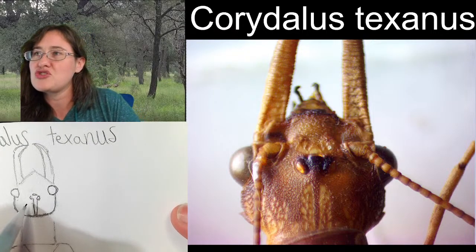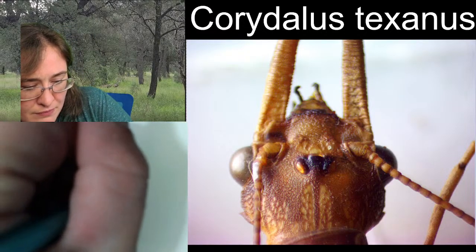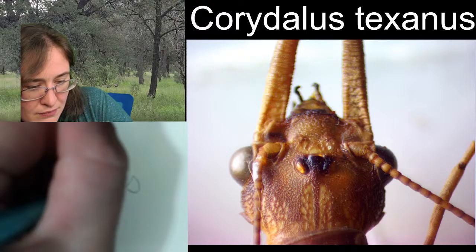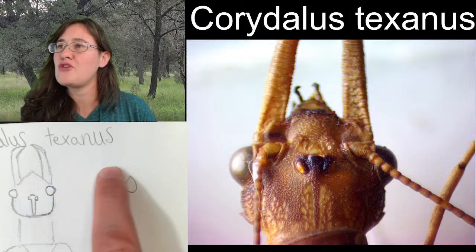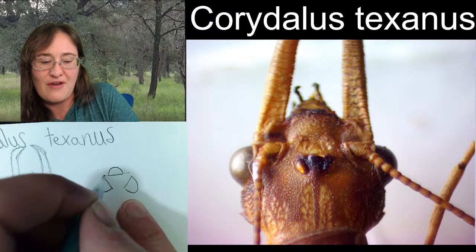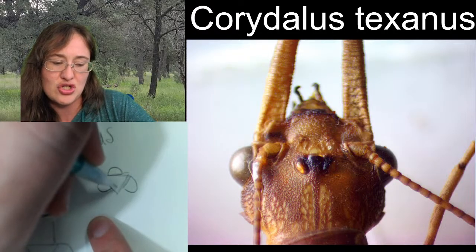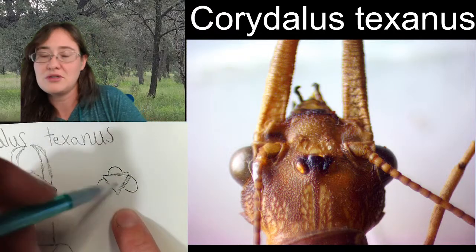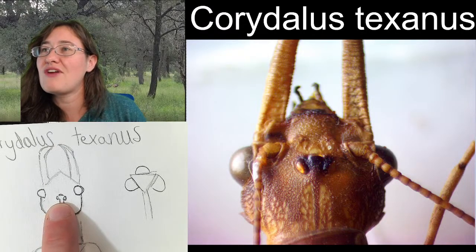If I was going to zoom in on that point, it looks a little bit like this, where you've got three eyes and they are centrally located, and if you actually followed the lines of these D's, in theory, they make a triangle that points down. Very, very small, right here.